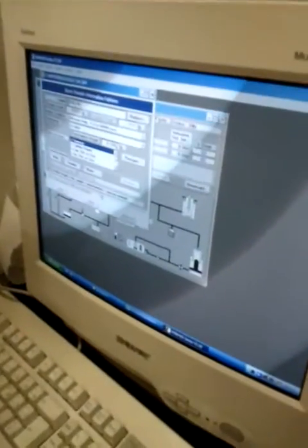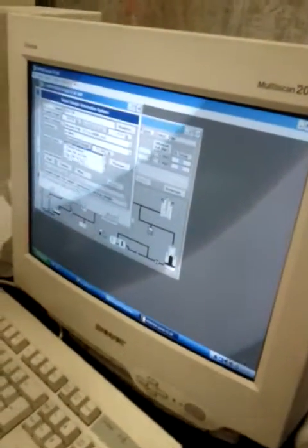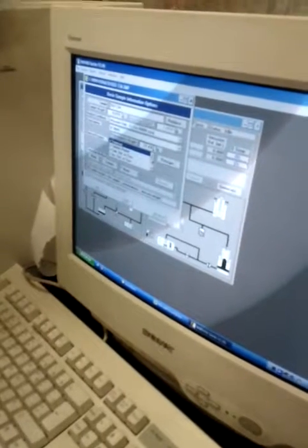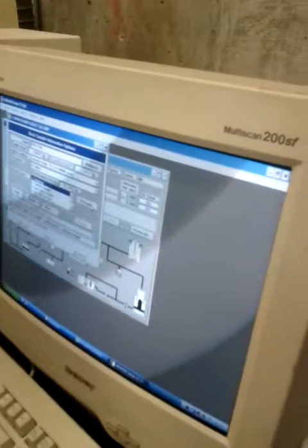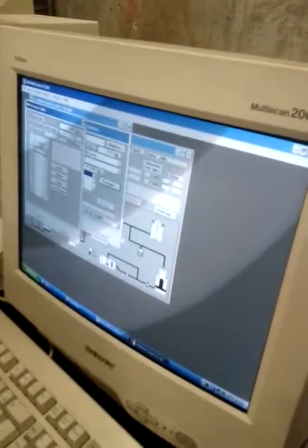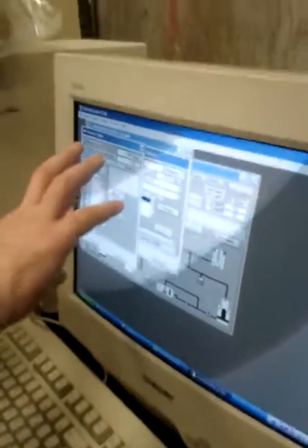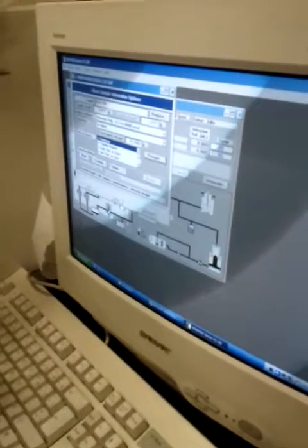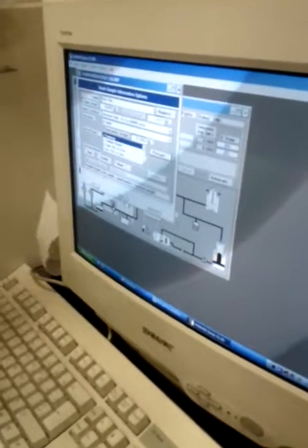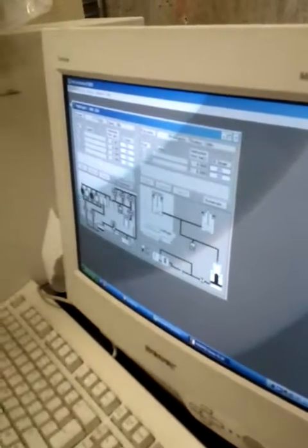Select reports. Here we select everything. If we click on pressure, we can have some data, but we will have access to this information later, so we will do it later. So now this is for the first sample, and we have to save the information. We save it, and now it is saved. We can close it and do the same thing for the second specimen.